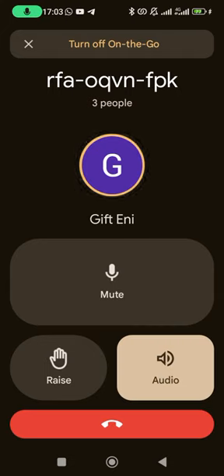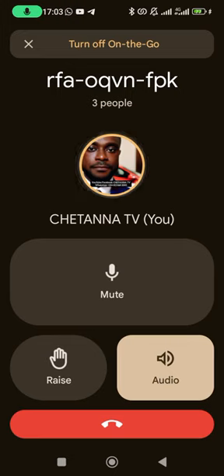On this, we'll take a look at some of the equipment. So we have mixing equipment. In your dispensing lab, in compounding, we have your pestle and mortar where you mix small amounts of ingredients to compound a given dosage form.